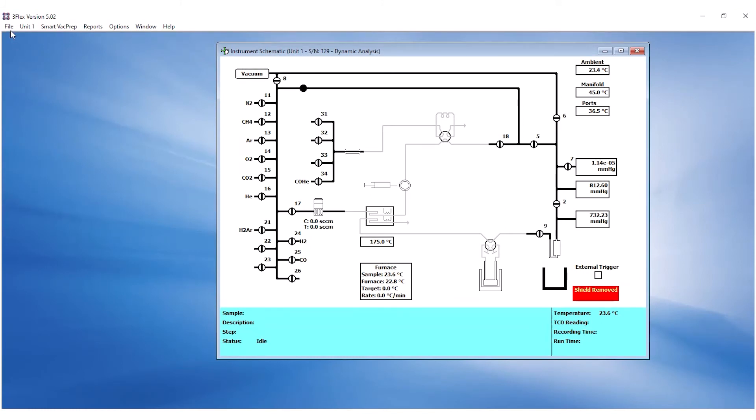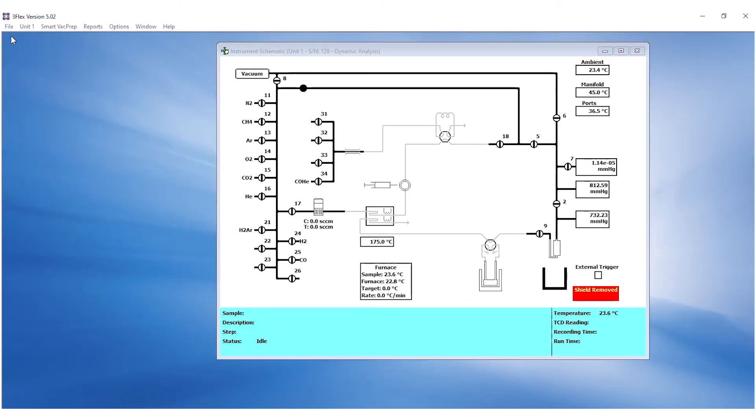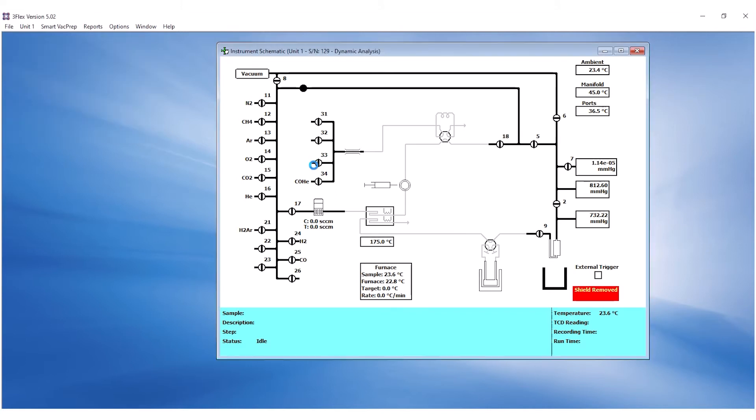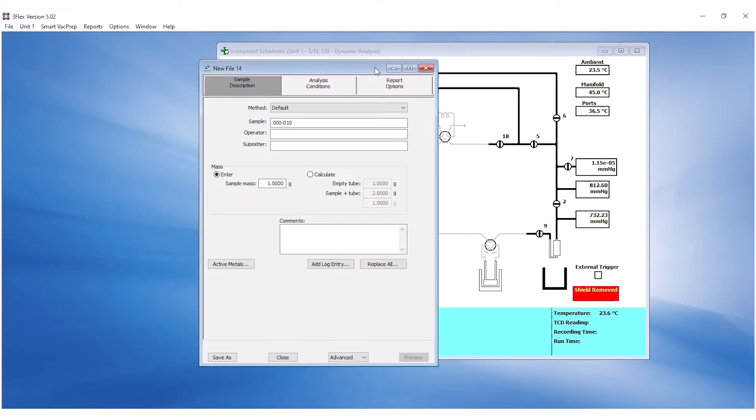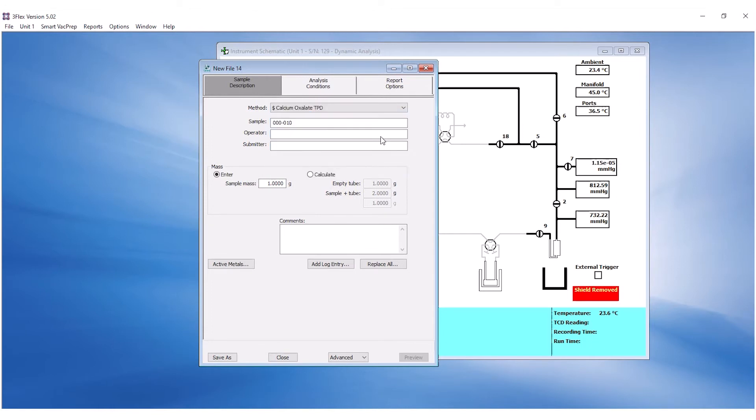To create a sample file, go to the File menu and click on New Sample. Select Dynamic Analysis for the sample type. Under Sample Description, select Calcium Oxalate TPD method on the drop-down menu. Rename the sample with the lot number and enter the operator's initials.